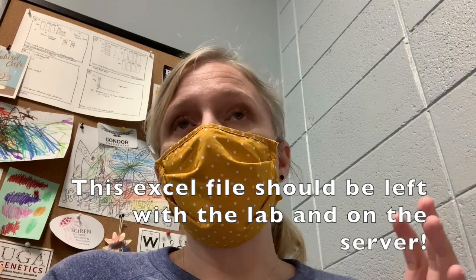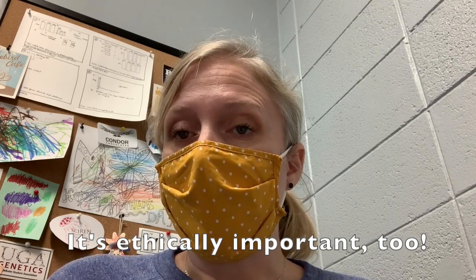So I should be able to, when you leave the lab, know every plasmid that you cloned, all this information about that plasmid. This is also much easier to do from the very beginning as soon as you join the lab than it is to try to keep all of this organized later on. So if you do this with your digital data, it makes it much easier for me to find things, for you to find things, and for us to make sure that there's continuity with the information that we have.